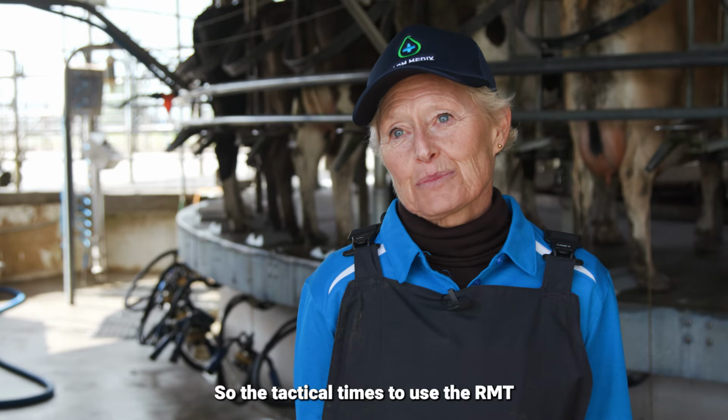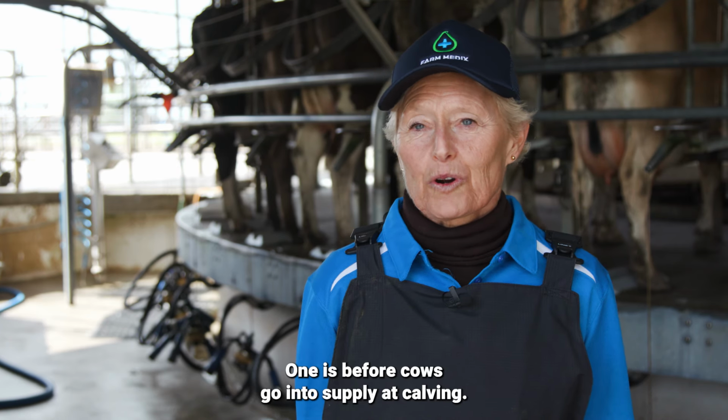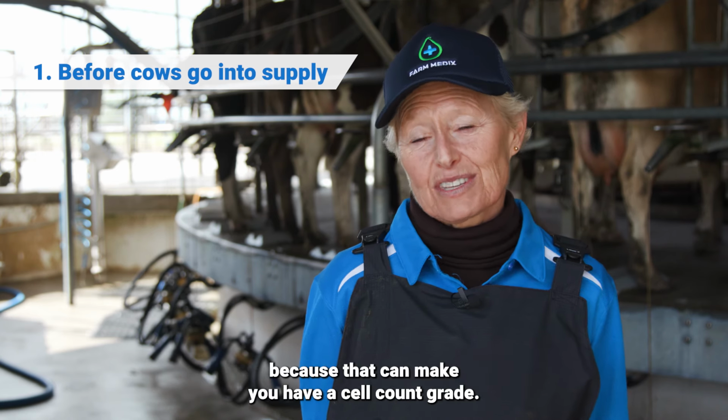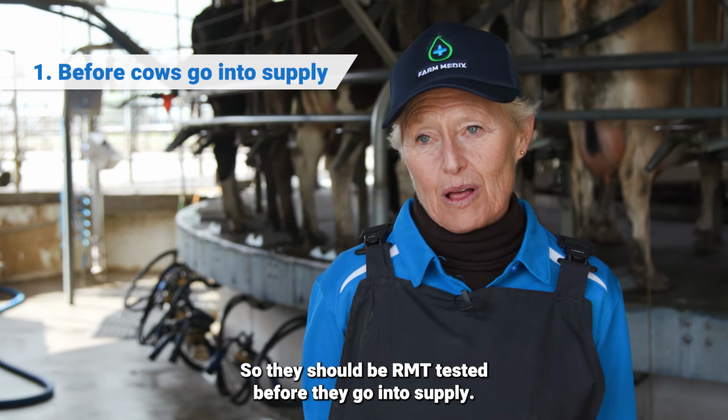So the tactical times to use the RMT. One is before cows go into supply at calving. You don't want to put any cows in supply with a high cell count because that can make you have a cell count grade. So they should be RMT tested before they go into supply.